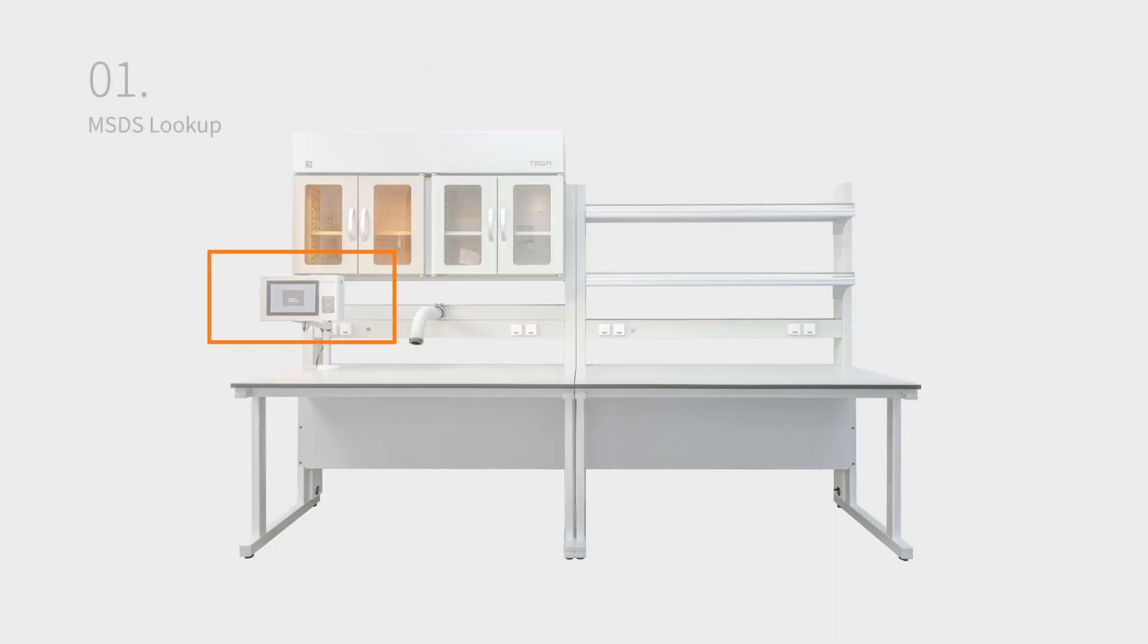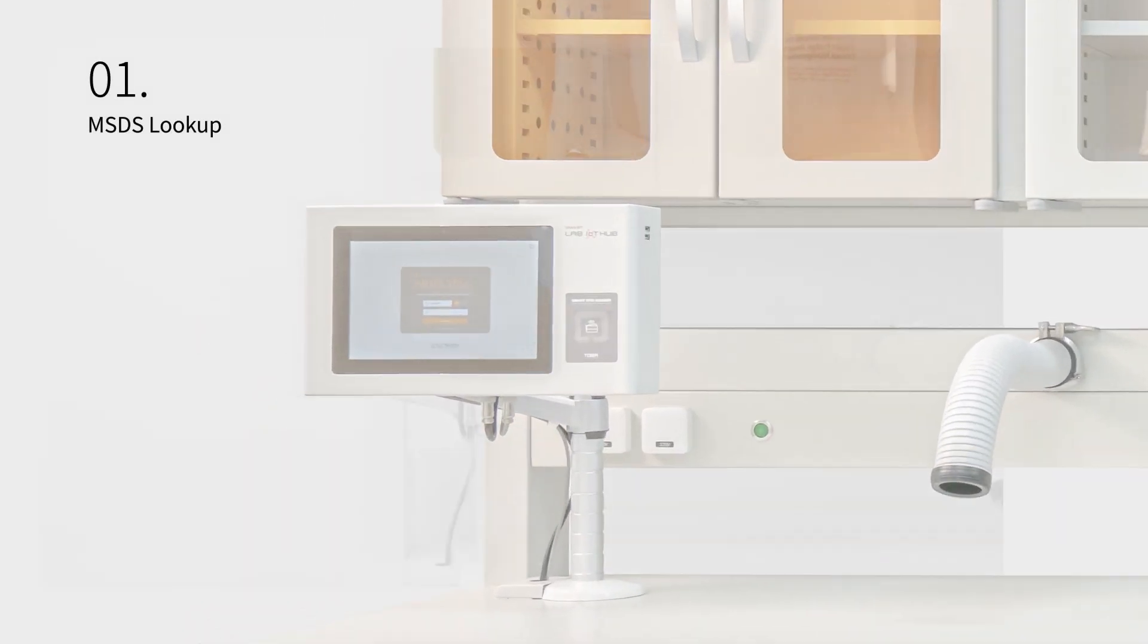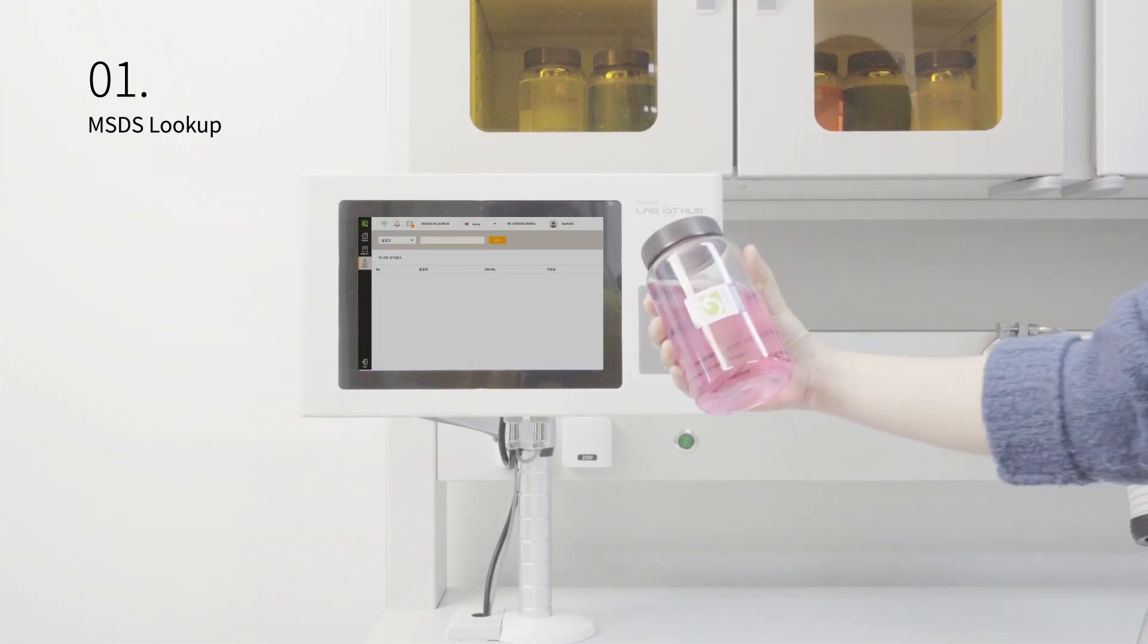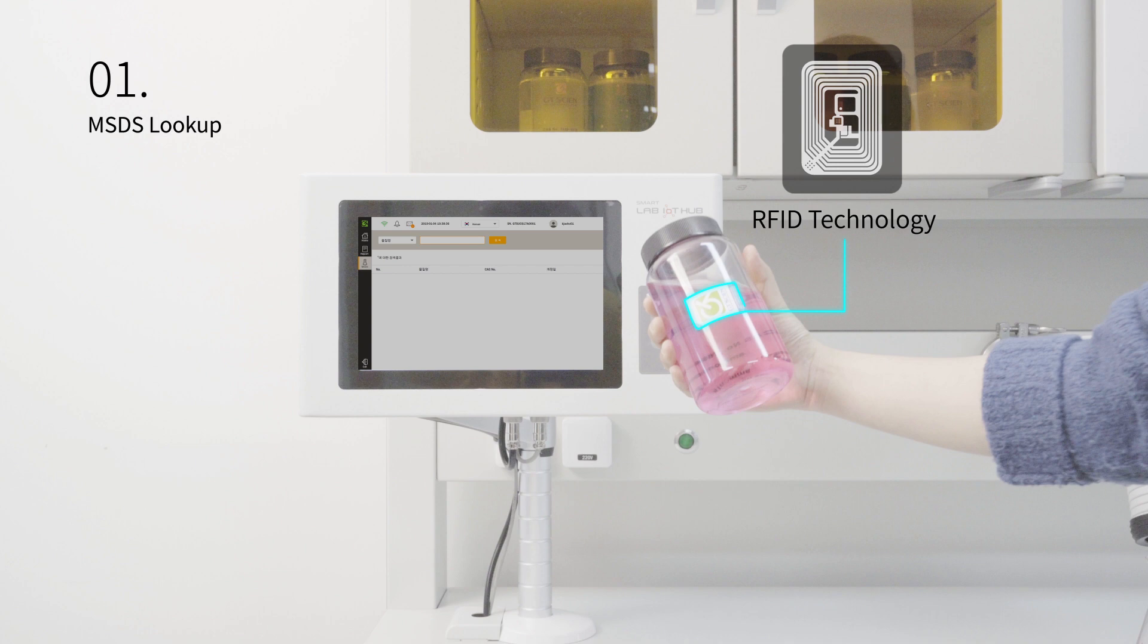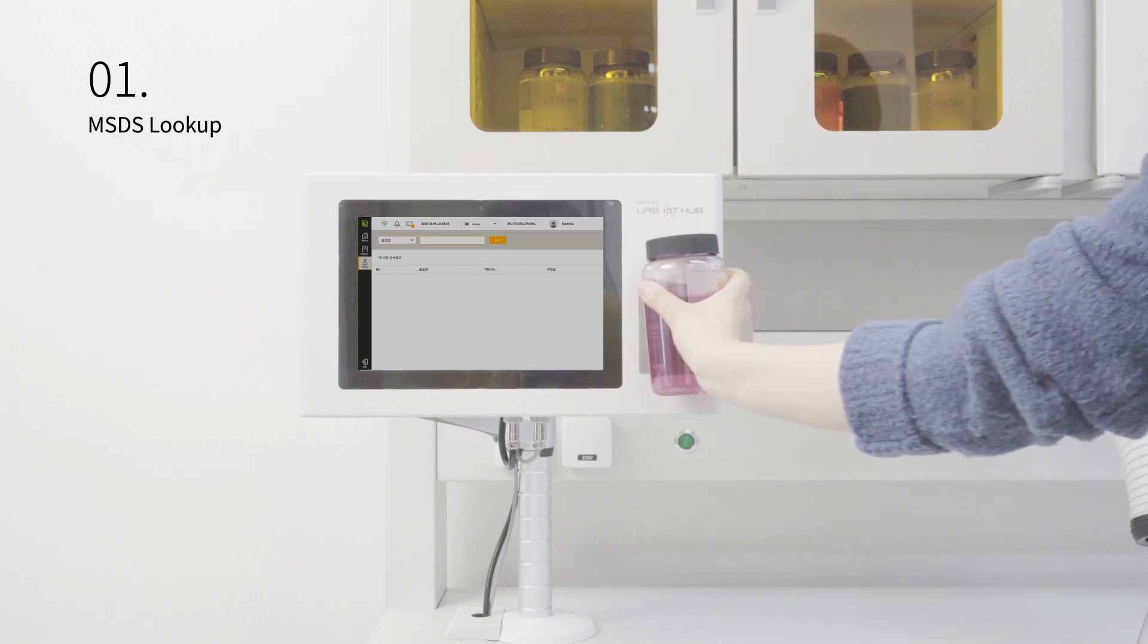With our Smart RFID IoT technology, researchers can check safety data sheets electronically in real-time before using dangerous toxic chemicals to ensure they are handled safely.